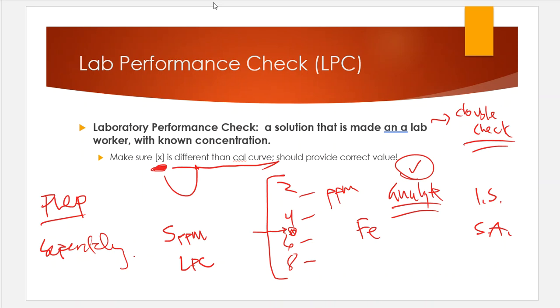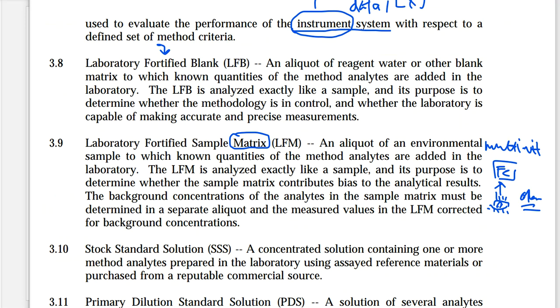And this is one of them that we have to ensure we keep along for the ride, because it's going to let us know if quality is built into the batch of samples that we're processing and getting data for. So we keep referring back to this original EPA document.